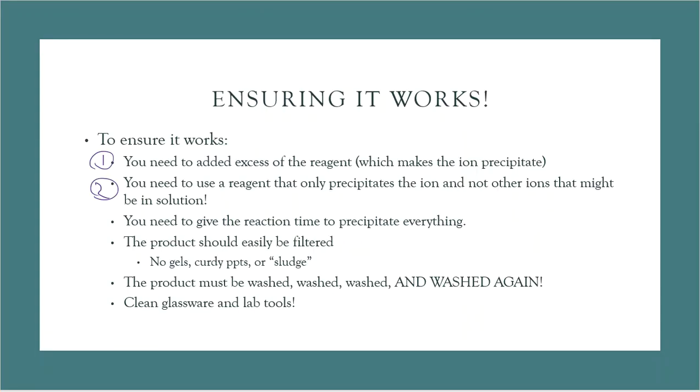We call that a co-precipitation. That's what that stands for. A co-precipitate, meaning that it's falling out as well as the thing that you're looking for. And we do not want those co-precipitations to happen. We really only want a reagent that only targets one ion or analyte of interest. That reagent should only pull that one out and leave everything else there.